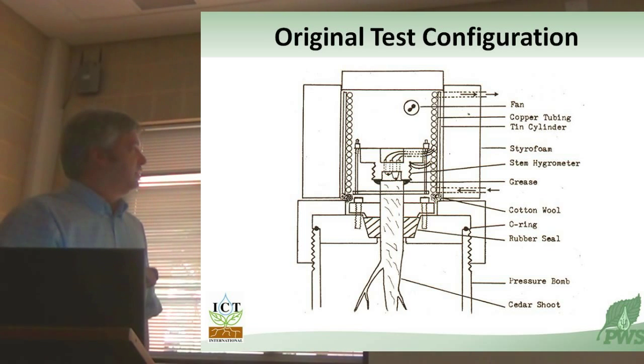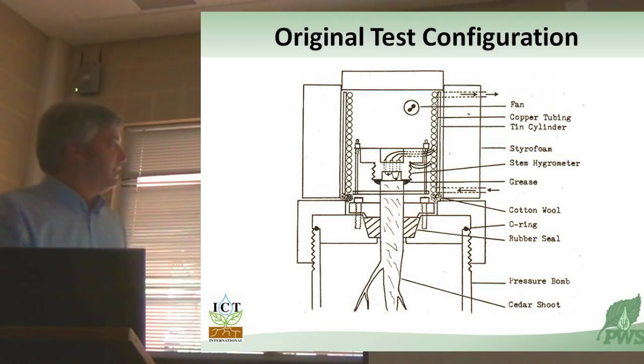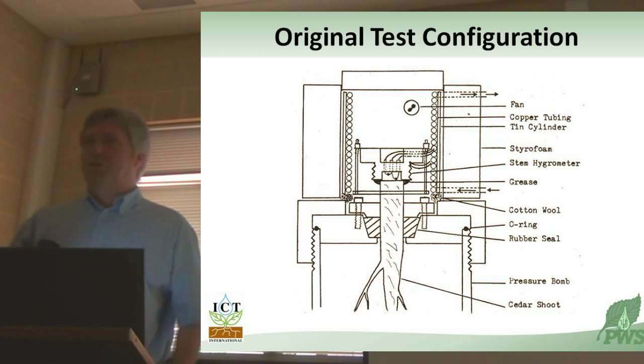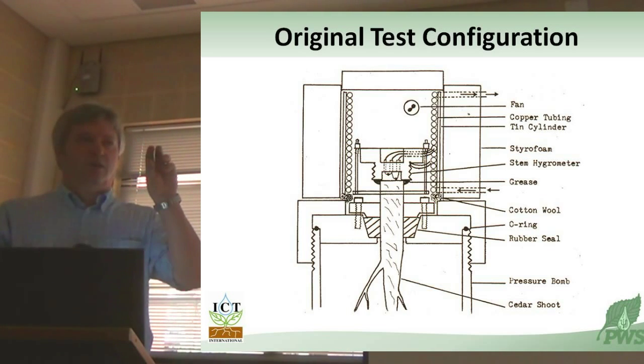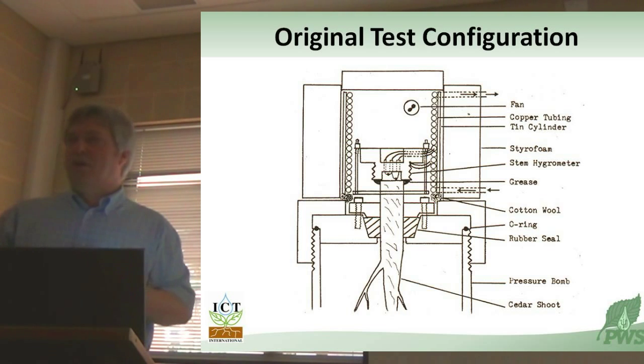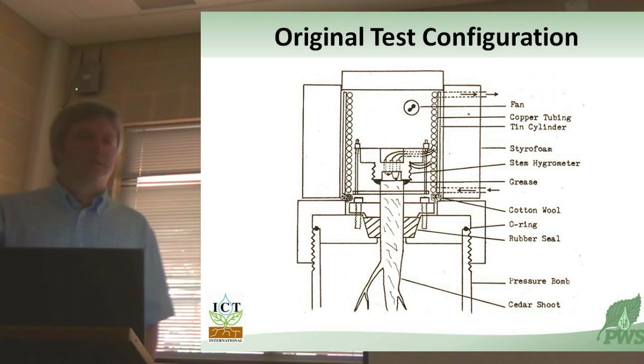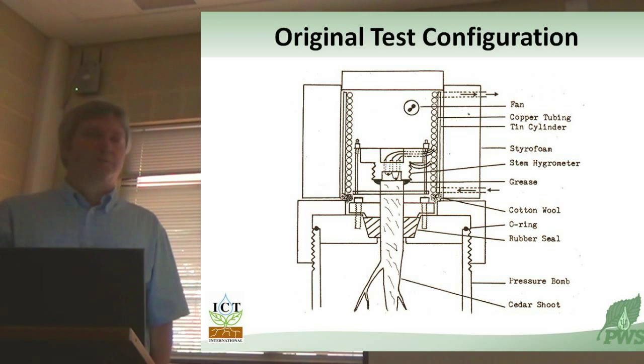This was the prototype - I still have it; I found it in the drawer the other day. I made it out of a stainless steel bolt. The business end of it is this little window, which is a tiny cell or chamber that is exposed to the water-conducting tissue of the sample. In this case, we've got it exposed to the end of a sample encased in a large Scholander-style pressure bomb.